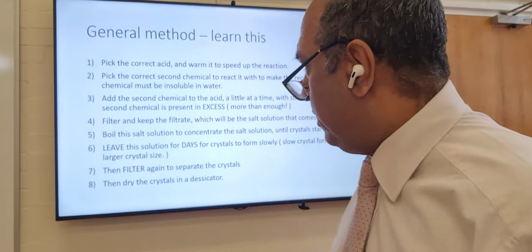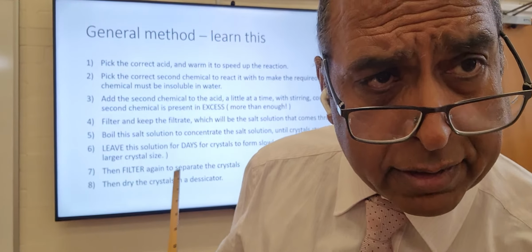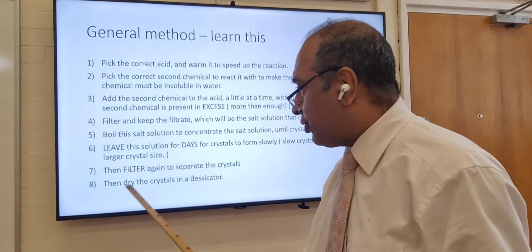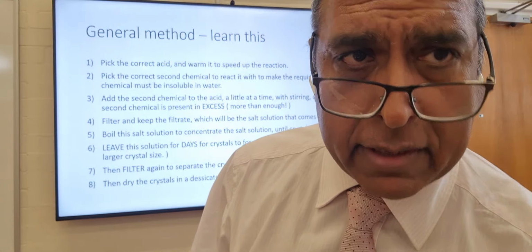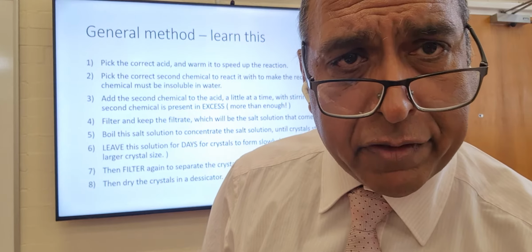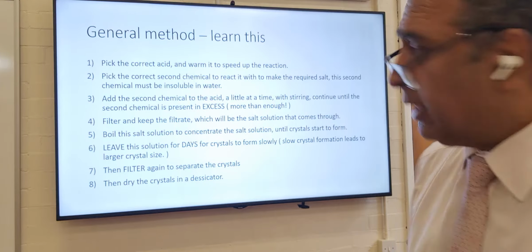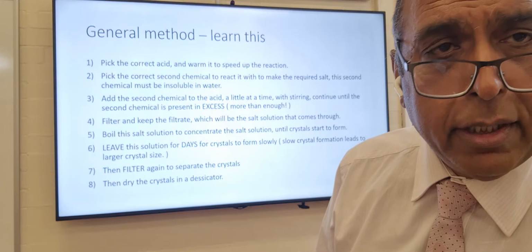The class then filter that solution, because there'll be solid crystals in there. And those solid crystals, they put in a desiccator. If you don't know what one of them is, I've explained it in my previous video. And put it in a desiccator to dry the crystals. That method is the general method, and I want you to learn it.